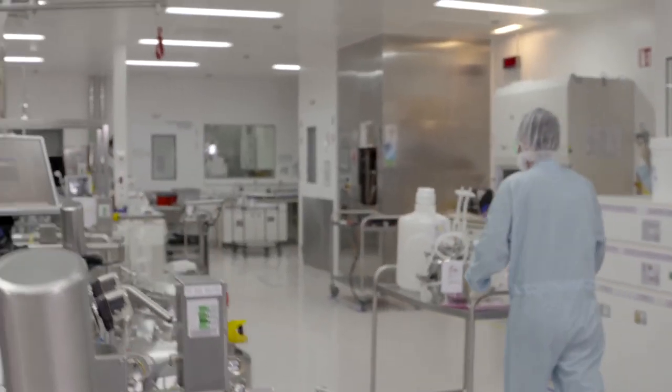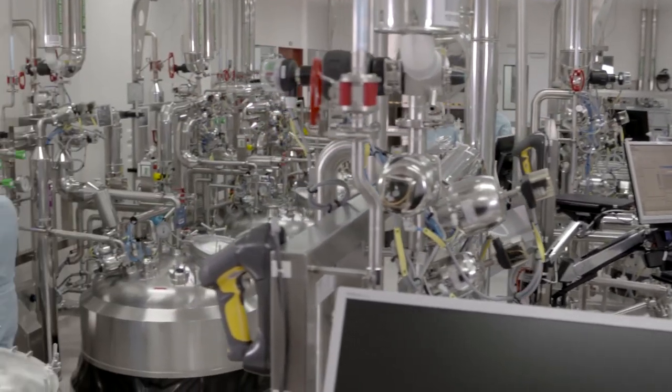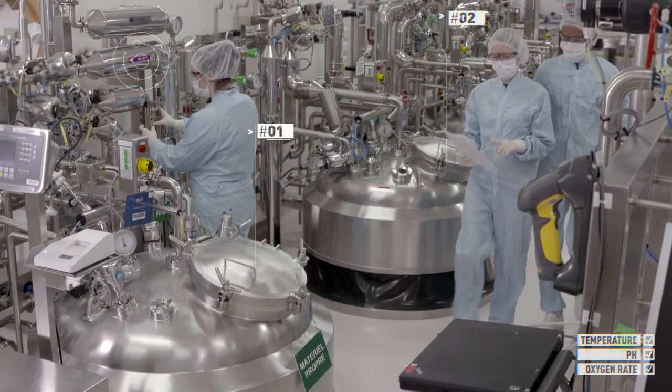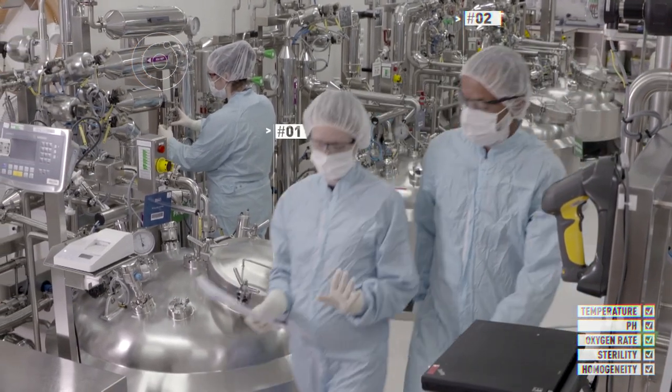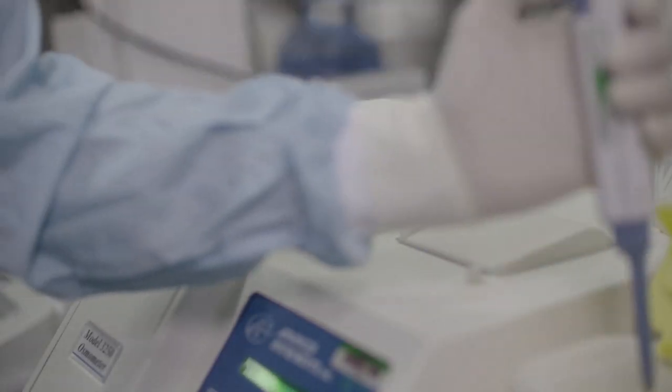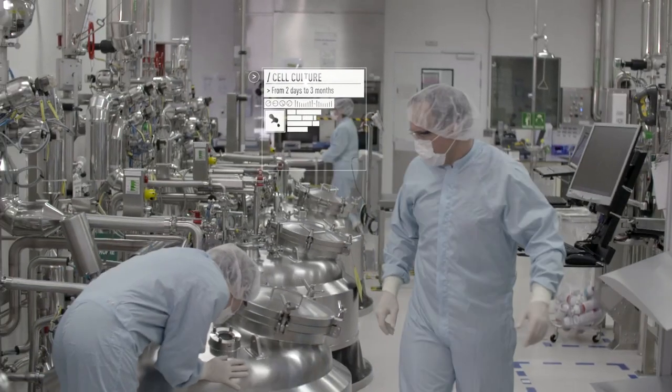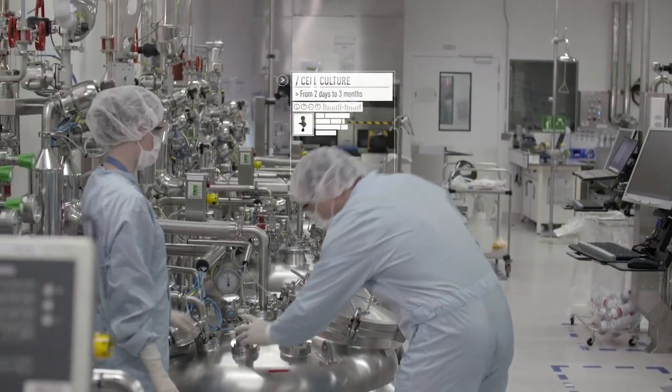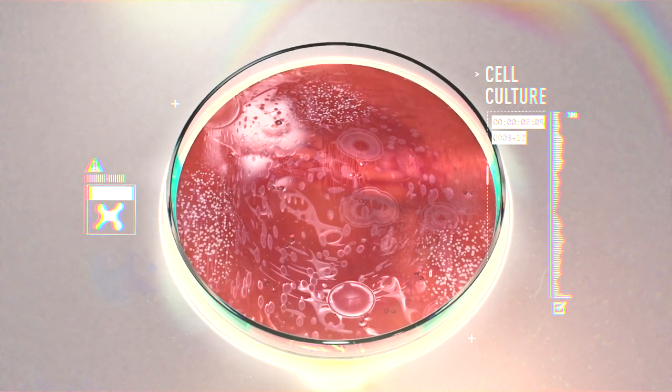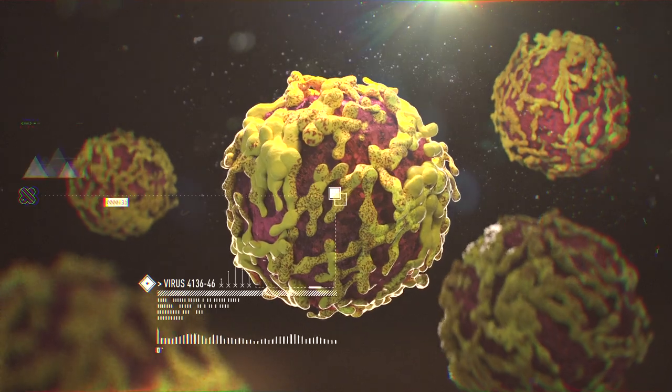Production starts with growing viruses or bacteria in the lab. A wide range of parameters must be managed like temperature, pH, oxygen rate, sterility, and homogeneity. The slightest variation in the culture media may compromise the production and cause delays. Depending on the vaccine, cell cultures take from two days to three months. From a small amount of original cell culture solution, the manufacturer can eventually produce millions of vaccine doses.